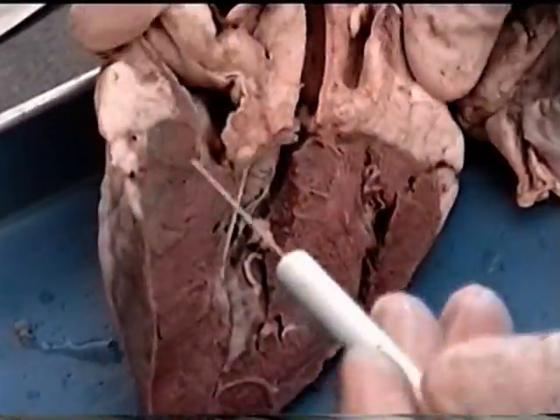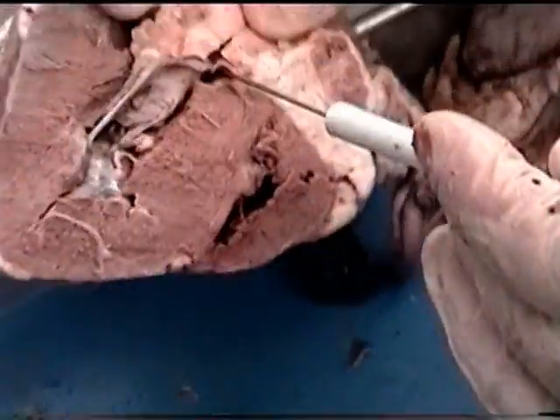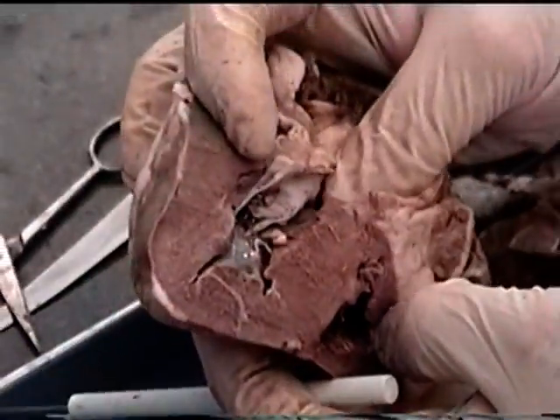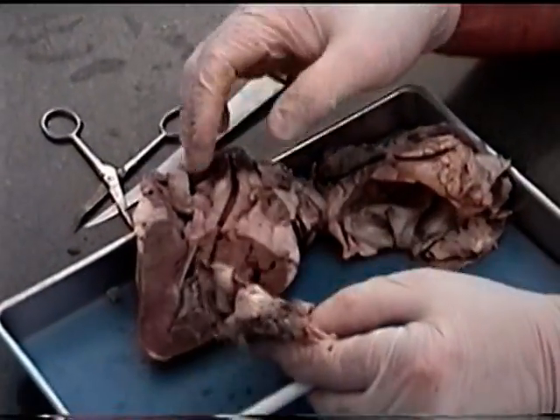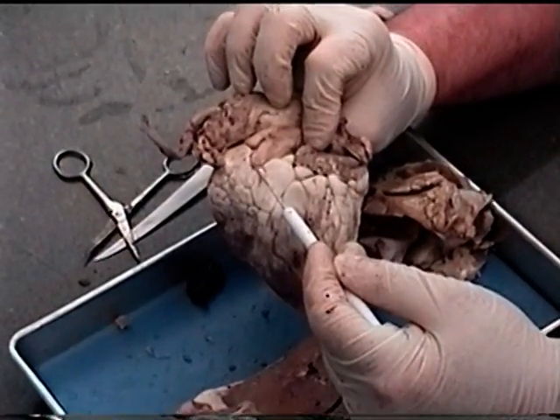And then the second sound, dub, is the closing of the semilunar valves, the aortic semilunar valve that we were seeing down in here. And then if we looked at the pulmonary semilunar valve, we would see a valve that's over on the pulmonary trunk right in here that we could see as well.